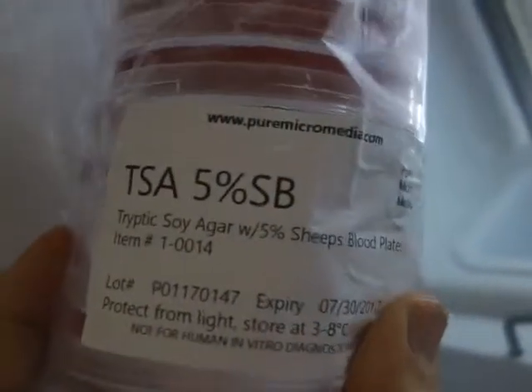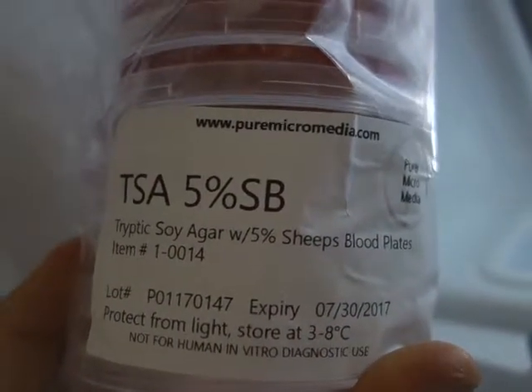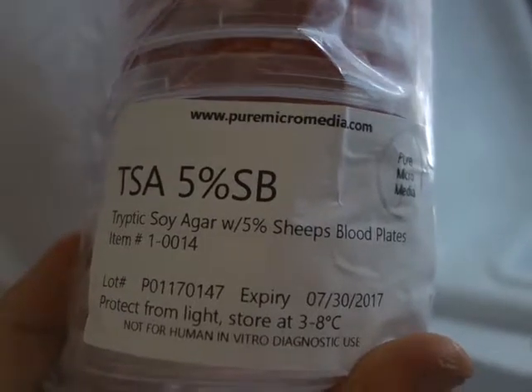So here's something that I have in my refrigerator. This is 5% sheep's blood SB agar, and I've got until July to use them. This says agar — you grow things in it.